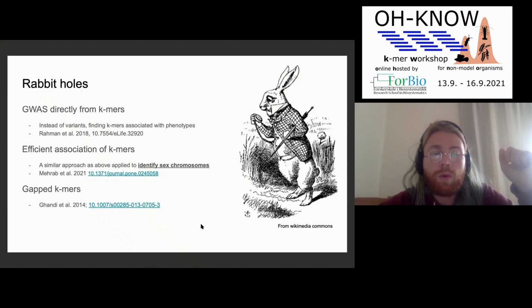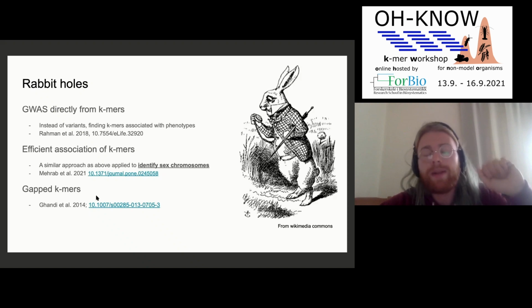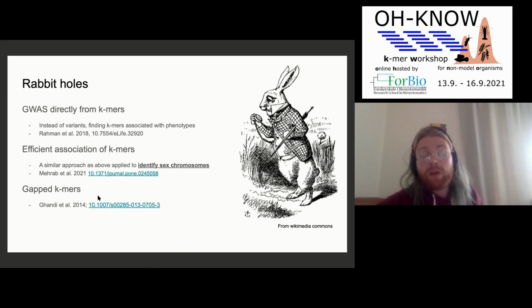And there is also a concept of gapped Kmers. I feel Lucía will mention it a tiny bit, but you can also make Kmers not as consecutive strings, but as strings that have a gap in between. But that's again a concept that is unimportant for the basic usage of Kmers.